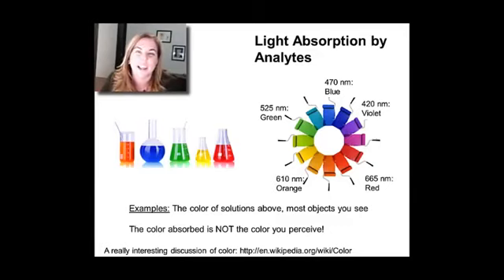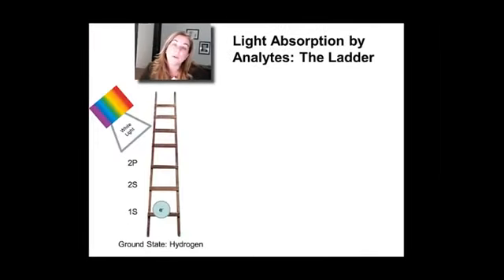As I said, we're fortunate because we're going to actually measure absorption with the spectrometer and get around that color perception. What's going on when something's taking away light, when it's taking away a certain amount of energy that photons are providing to the sample? Well, the reason it's taking away that energy is because its atoms are starting off in the ground state. What that means is that those electrons that are bound coulombically to the nuclei of atoms exist in a state which is the ground state. It's the state when they don't have a lot of energy and they're just sitting there. They're going to be in a ground state at room temperature, let's say.